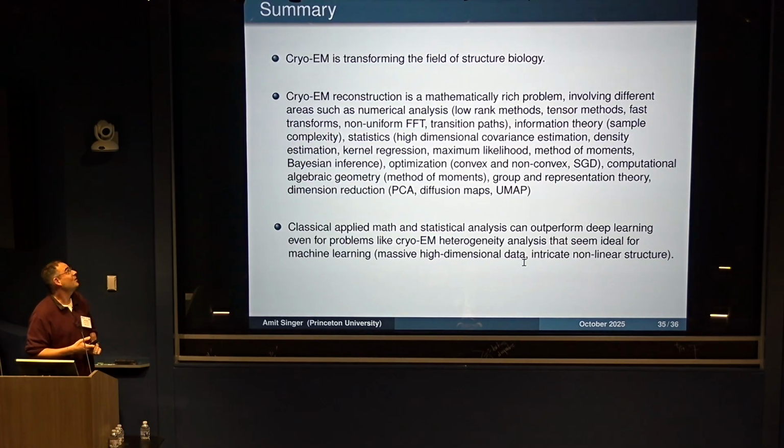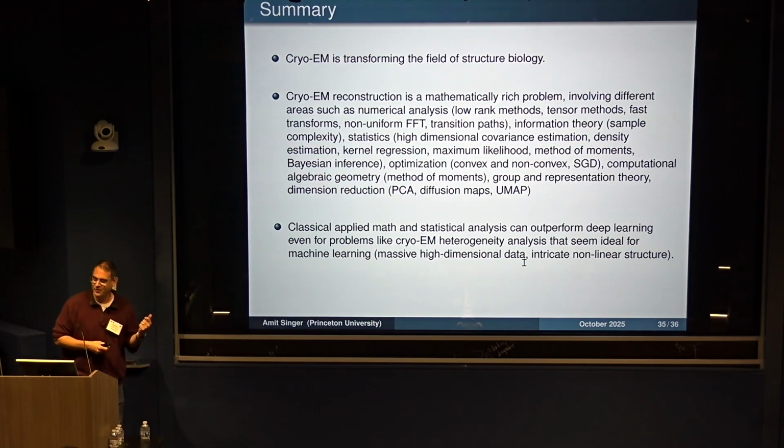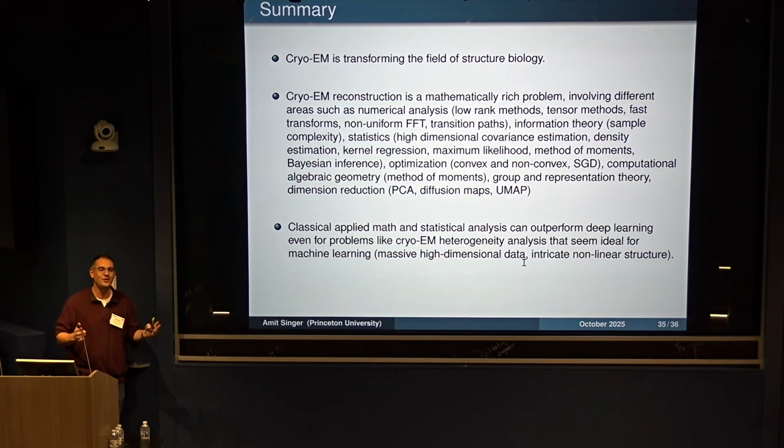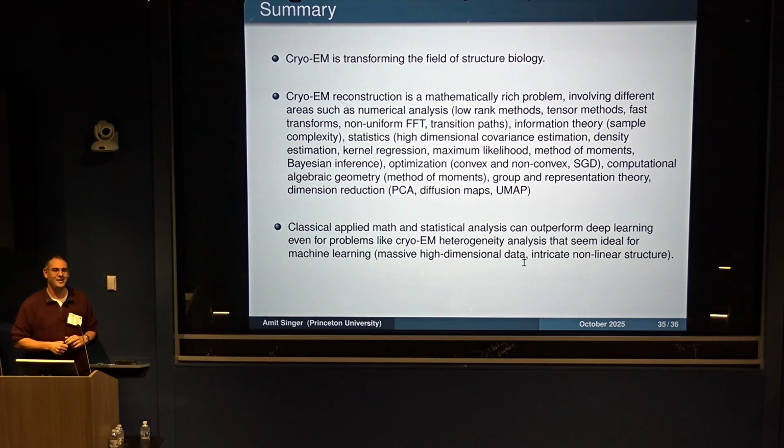And I just want to summarize with those 3 points. So first of all, cryo-EM is transforming the field of structural biology. I hope I was able to convince you of that in the first part of the talk. Second, reconstruction is a very rich mathematical problem. I haven't even touched all of it, but I kind of joke with people who want me to tell them about cryo-EM that whatever math you're interested in, I'm positive I can find a subproblem in cryo-EM that will suit you, okay, and that you can work on.